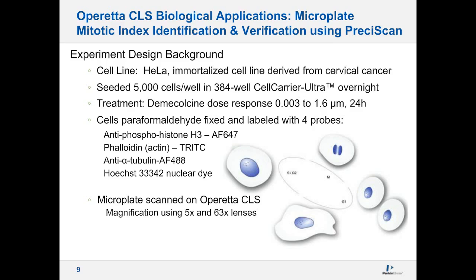When we talk about what we're interested in measuring in this particular case, we're talking about the mitotic populations here. I'm going to show you some examples of how we are able to measure a rare event, or close to rare event, of mitotic cells, using a 5x objective lens in wide field mode. And then we switch over to do the rescan with a different algorithm using a 63x water immersion objective, and then taking a small Z-stack of those images.